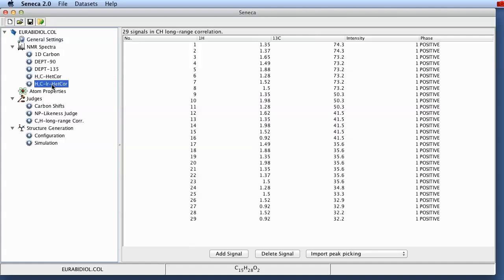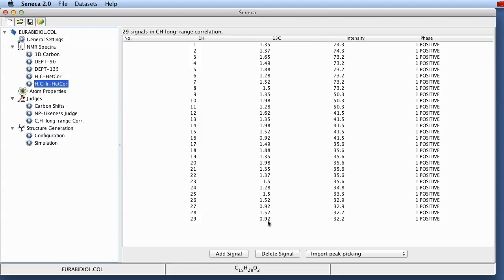And then we've got the 2D carbon hydrogen long range correlations that correlate hydrogens and carbons which are two or three or even more bonds apart. So you can see here for example there's a correlation between a hydrogen resonating at 0.92 ppm at the bottom and a carbon resonating at 32.2 ppm.